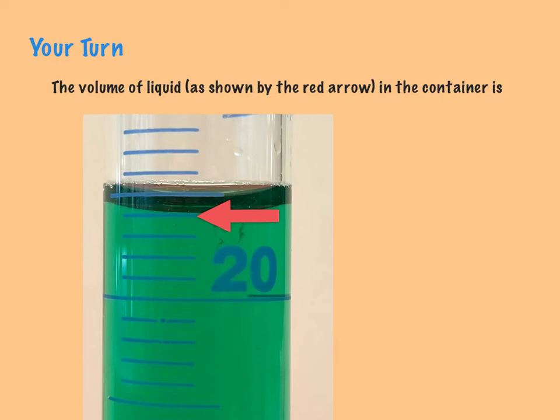What I'm going to give you is a series of these containers, and they've got colored liquid in them. I want you to look at where the bottom of the meniscus is—see it's a big black line there. I want you to see this and then tell me how much liquid I actually have. This is in a 25 cm cubed one.